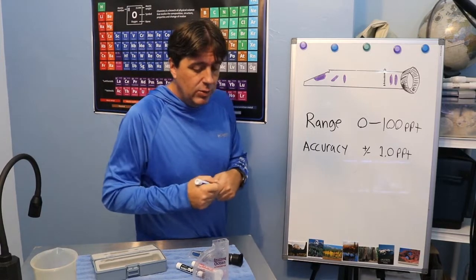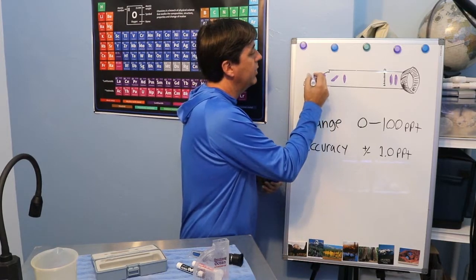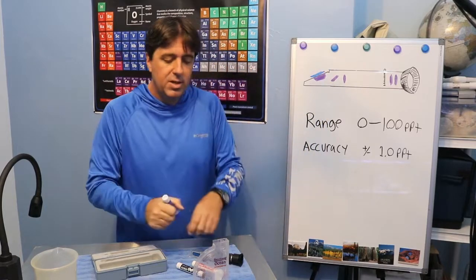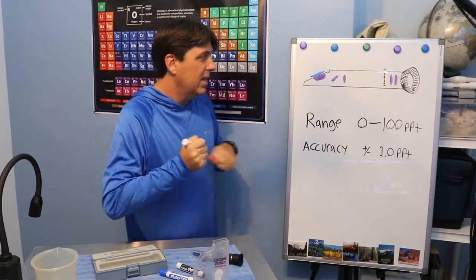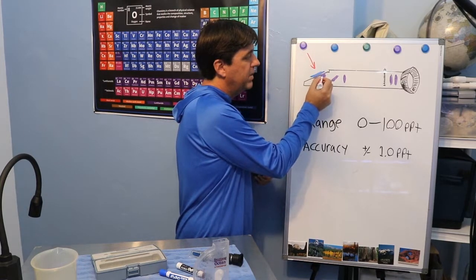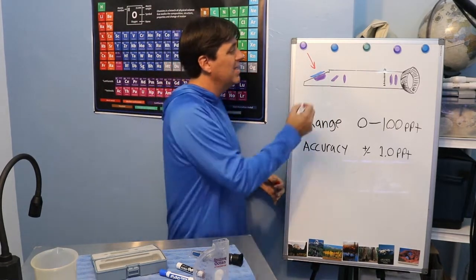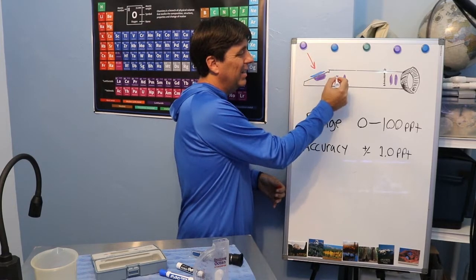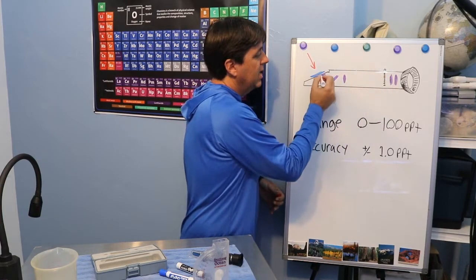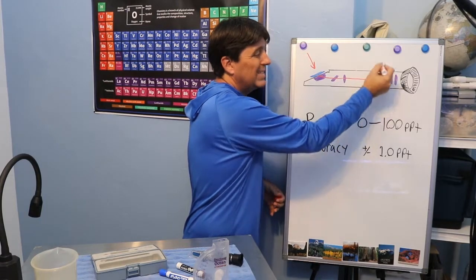I am going to use the blue as the water. This is the faceplate, and if I put a little water on the faceplate, there we go. And I'm going to use red so you can see it as light. The light comes down from the sun. It gets bent, and this purple blob right there represents a prism. That prism helps bend the light towards some of these optical components and lenses, and so the light gets bent and shown through to the scale.